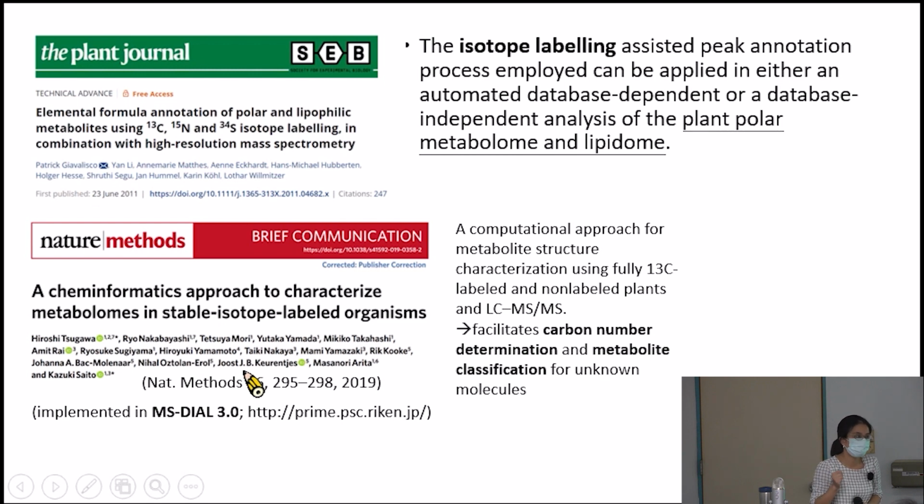So I would say we don't get precise metabolites in our samples from this data set, because we do not have enough data. But they try to use different algorithms or calculations to create one more potential prediction model for everyone to use.